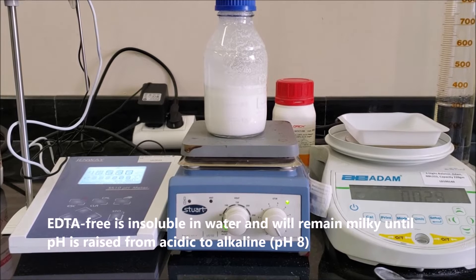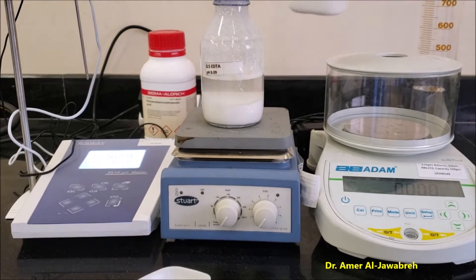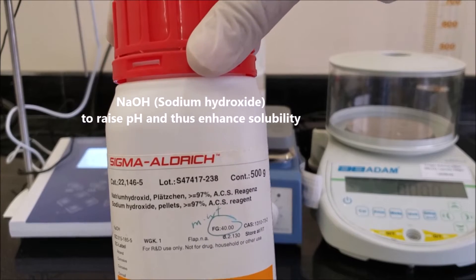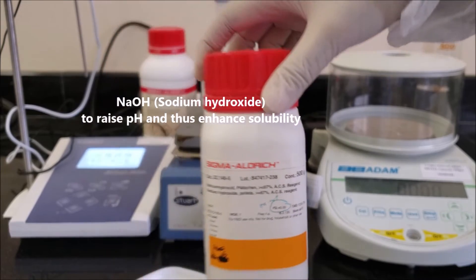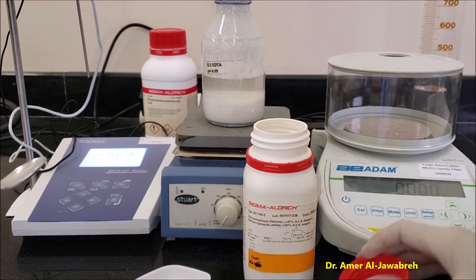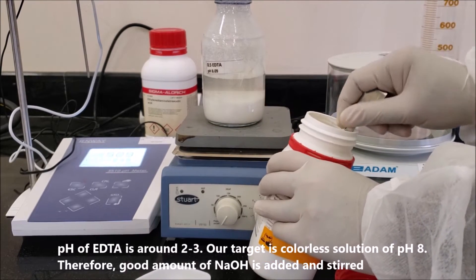EDTA is insoluble in water and remains milky until the pH is raised from acidic to alkaline. The pH of EDTA is around 2 to 3. Add NaOH (Sodium Hydroxide) to raise the pH and thus enhance solubility.